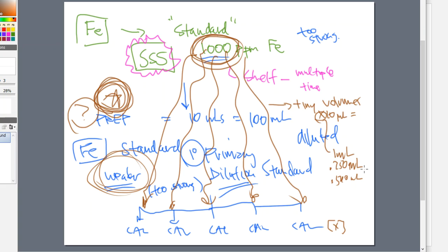And without a proper calibration curve, folks, you can't do anything. There's no quantitative work that can go into running a batch of samples. So the calibration curve is very, very important. Without that curve being proper, nothing else can get done. So we don't want to take any chances.